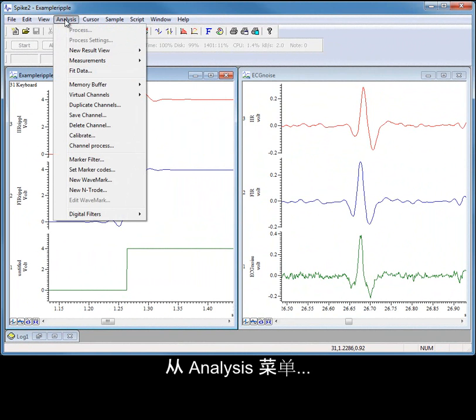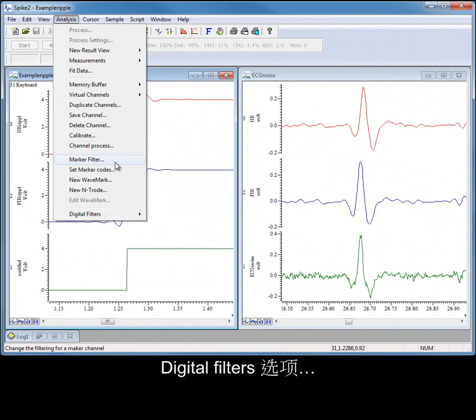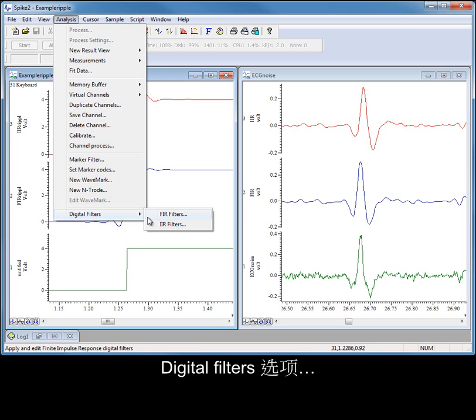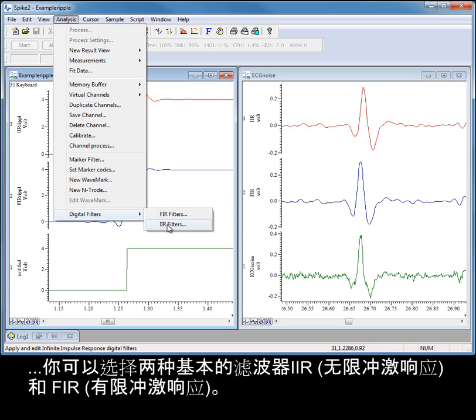From the Analysis menu, Digital Filters option, you can select between two basic types of filter: IIR and FIR.